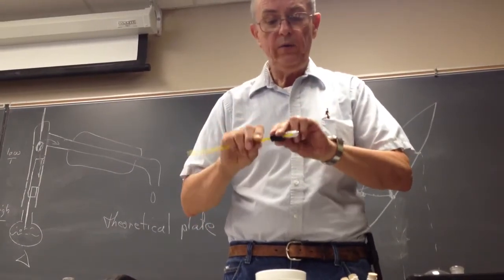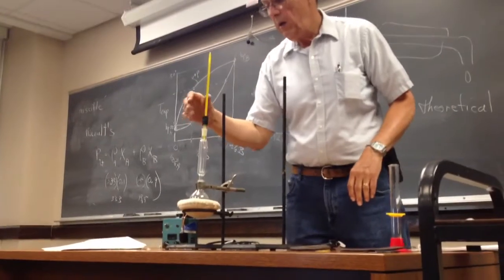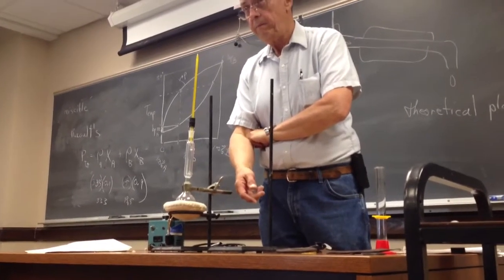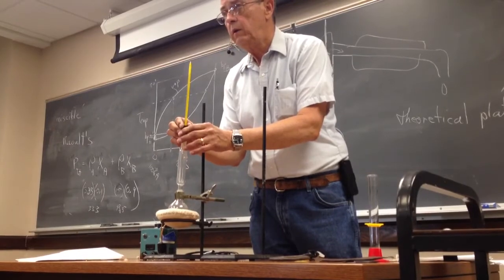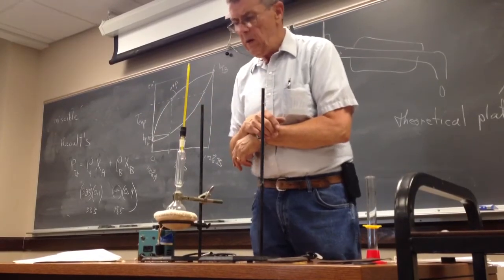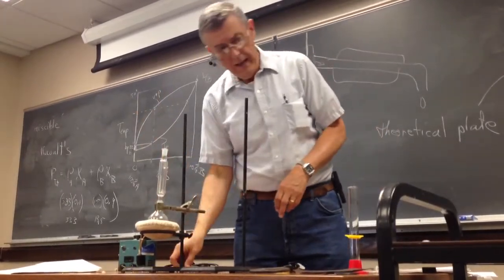So I just sort of twist it like so. I'm putting it down in here. And then I'm going to set this on there. I could measure the temperature, but I have just generated what's called a glass hand grenade, because when I heat that, it's closed. Boom. Something's got to give. Oh, well, okay, so that can't be right. I've got to redirect it anyway. So that doesn't want to be on there like that.